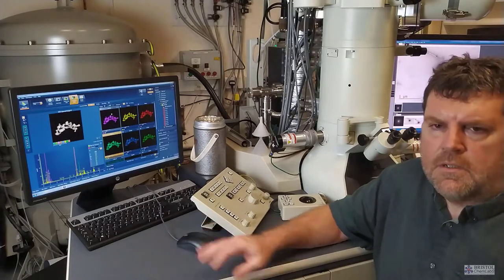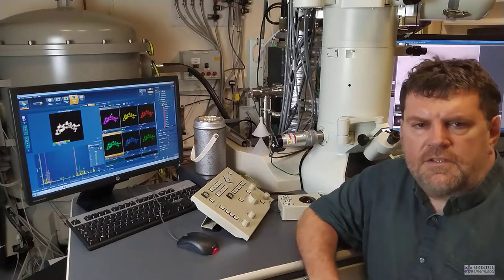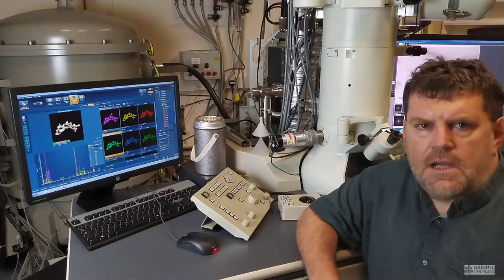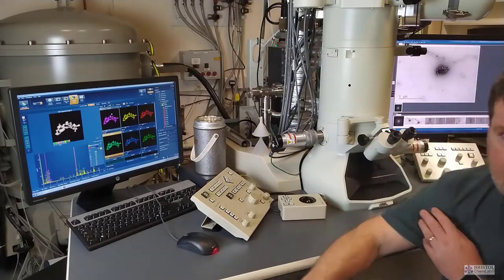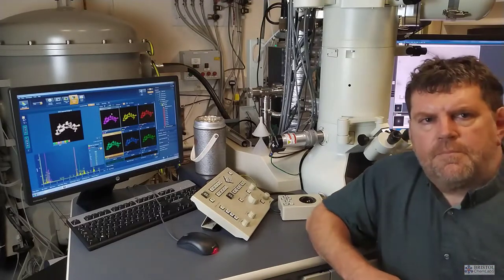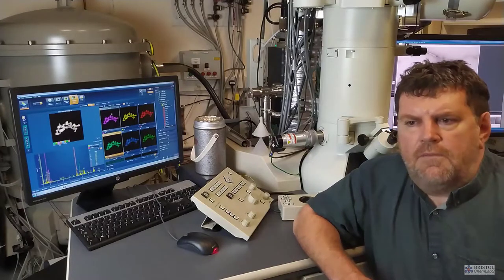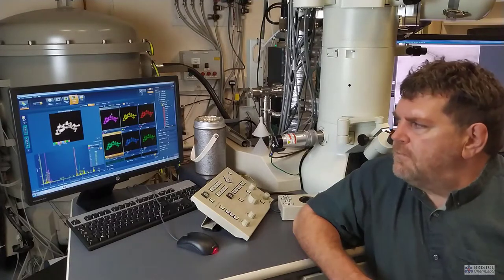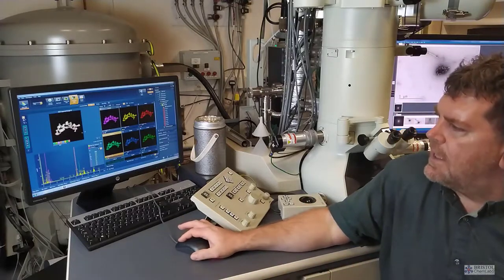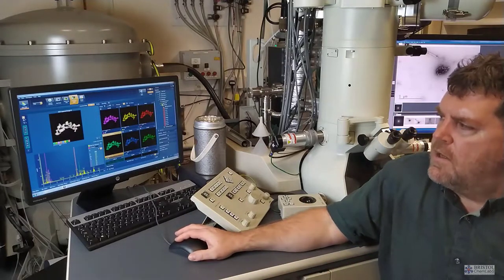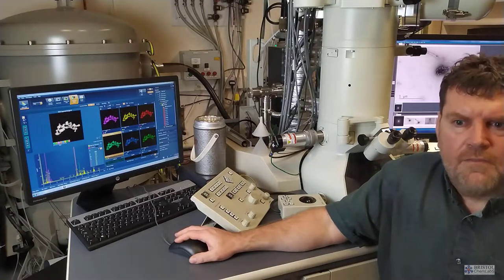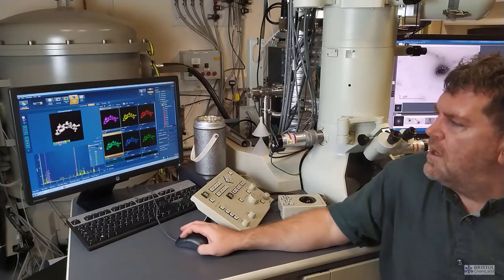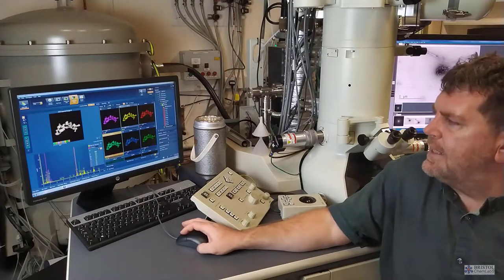The key difference is, unlike on the scanning electron microscope where the resolution is limited to the order of tens of nanometers for this type of analysis, on this transmission electron microscope we can actually use a beam size or a probe size of the order of sub-nanometers. So we've got a very small electron beam as a probe to analyze the sample. So in this case, we can look at materials that are nanoparticles, particles that are of the order of tens times 10 to the minus 9 meter in diameter, and actually plot the distribution of the elements at that very small length scale.